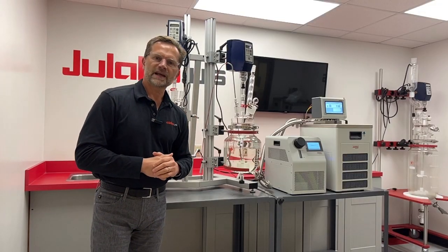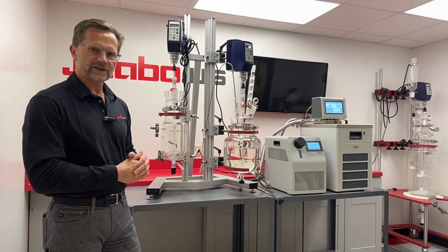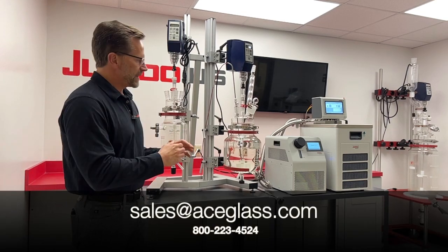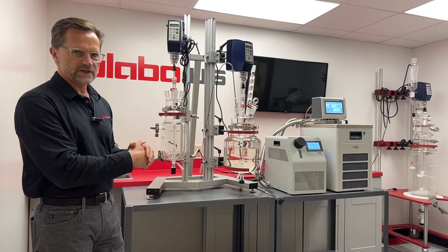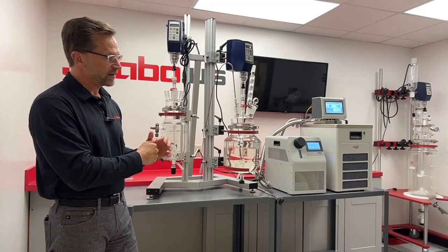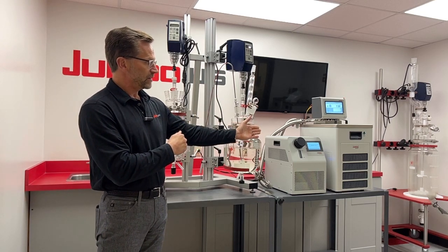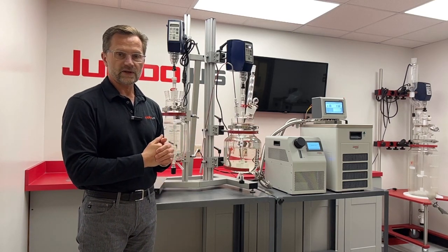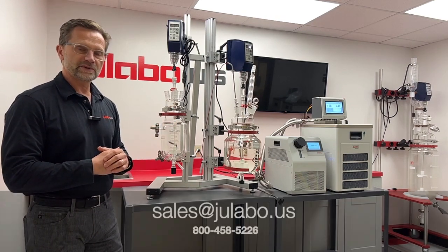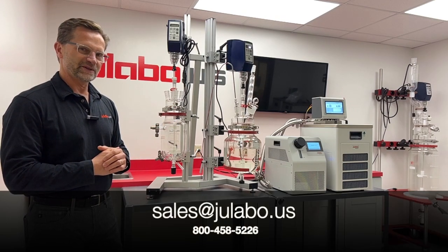For additional information on the Ace Glass dual reactor setup, please reach out to them at aceglass.com. They can assist you with your configuration and setup for whatever accessories you might require, including pairing with a JULABO chiller or refrigerated heating circulator for the reactor. For any liquid temperature control questions, please look us up at julabo.us.